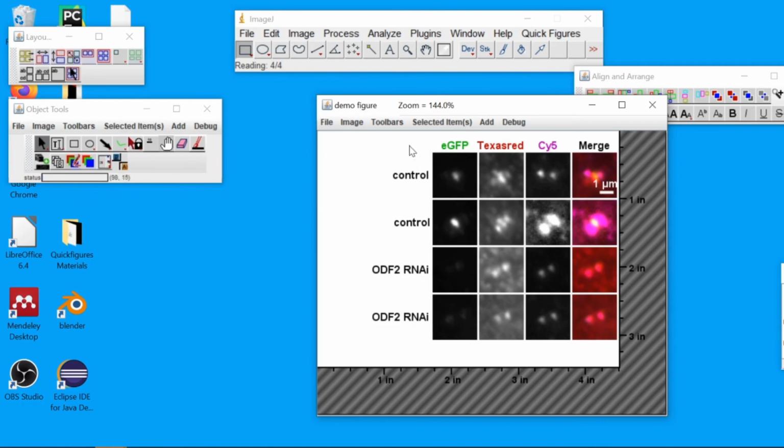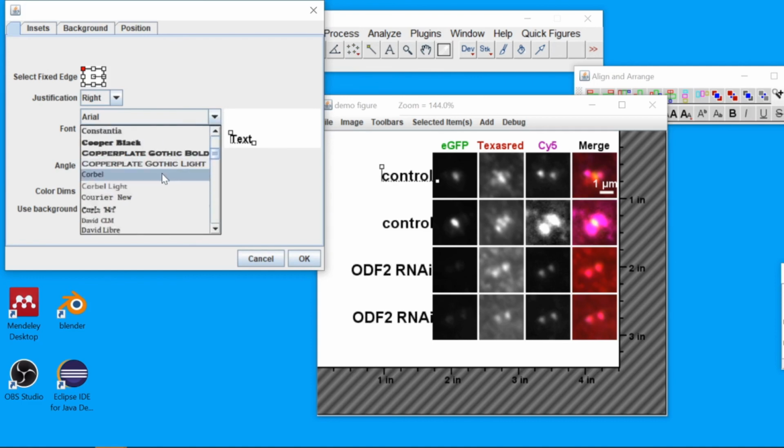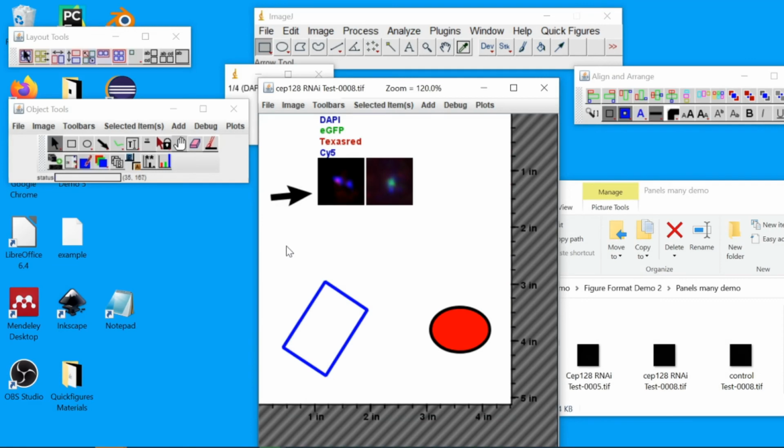And we can continue making every other kind of edit to the figure. You can edit the row labels collectively, by simply right-clicking on a row label and going down to the Edit All Row Labels menu option. Once you've done this, the changes you make should be applied to all the row labels, including changes in font and other properties. That's convenient. Most types of edits are common sense. You can click on an item to drag it where you need it to be, or edit it in any way that you find useful.